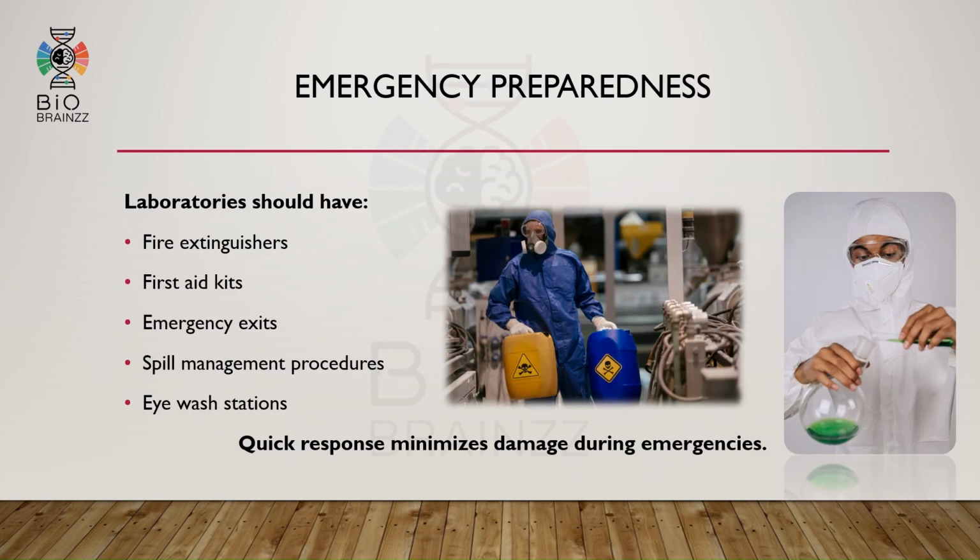Even after taking precautions, emergencies can still happen. That is why laboratories should always be prepared for emergencies. Essential emergency systems include fire extinguishers, first aid kits, emergency exits, spill management procedures, and eye wash stations. Quick response during emergencies can minimize damage and protect lives.